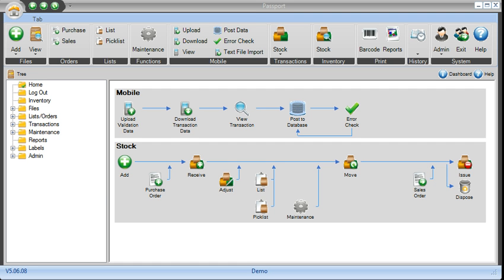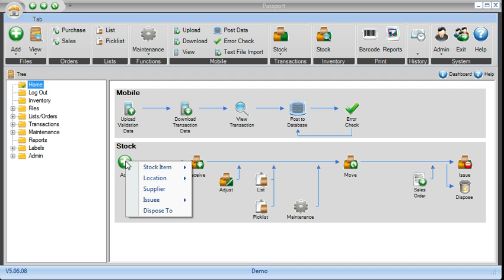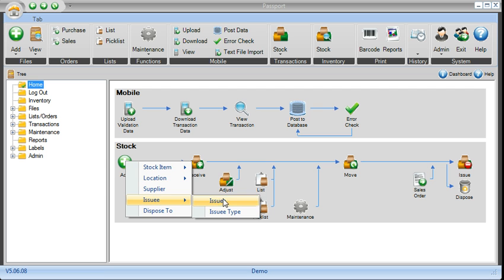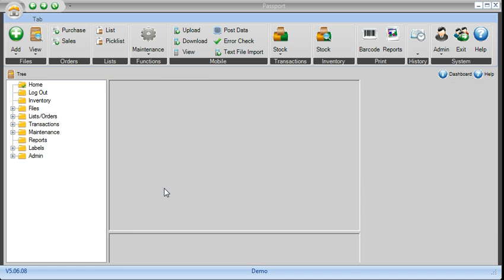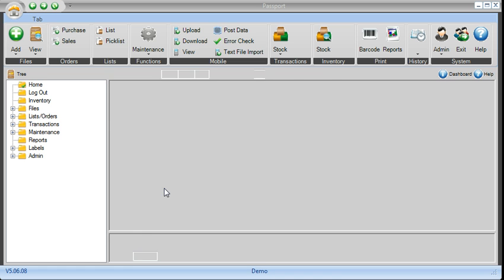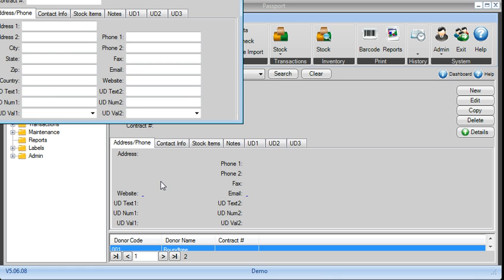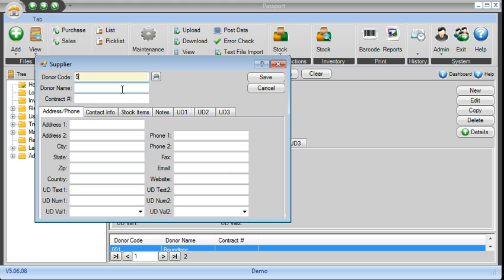Now when you first buy the application to pre-create your ecosystem or all the items that you have, you click on the add button, you create your disposal methods, you create all the consumers of your specimens, you come in here and create all the suppliers that you have.